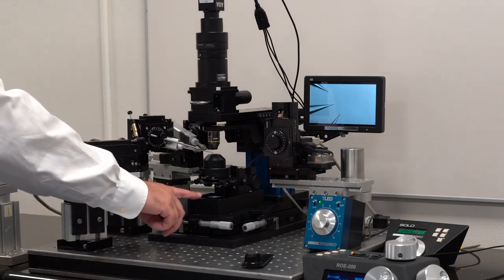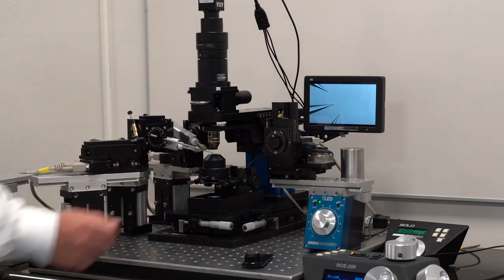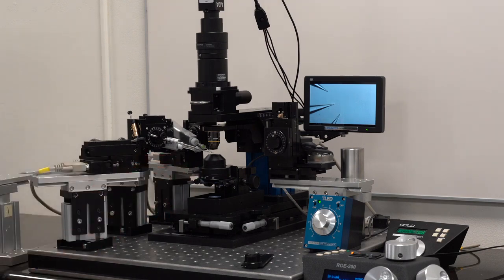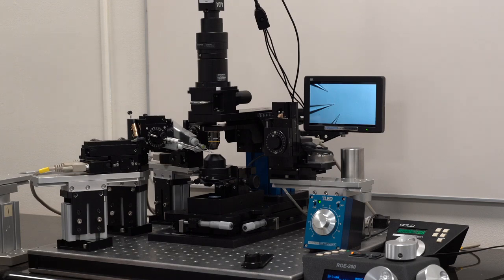This transmitted light base is a single white light LED going through the Olympus OCC condenser. OCC stands for oblique coherent contrast. It is a very nice condenser. The LED is powered with the TLED driver, which you can see here. You can send that TTL pulses if you wanted to trigger the LED on and off.